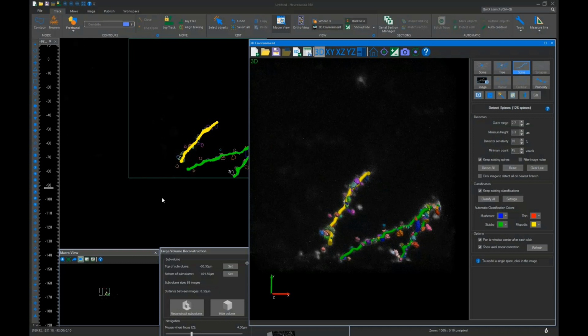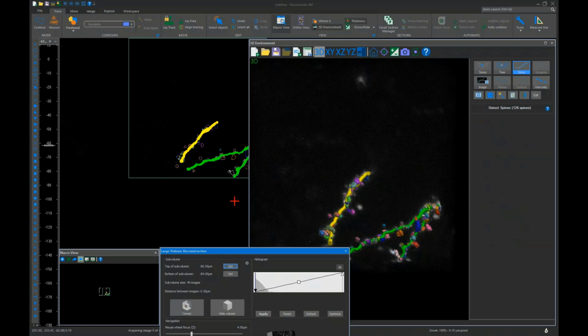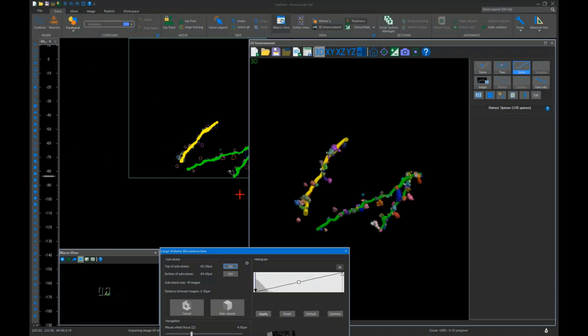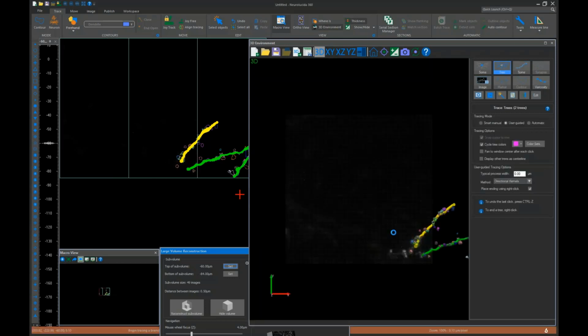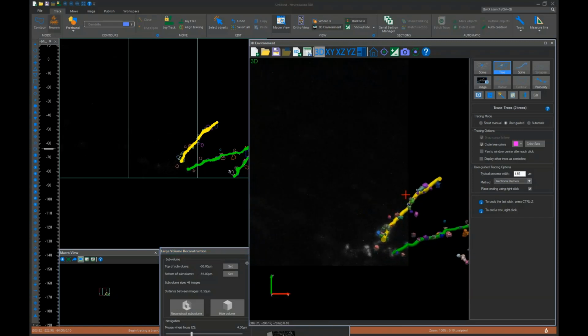When you have your reconstruction in Neurolucida 360, you can select a single button click to send the data file to Neurolucida Explorer. When you do so, Neurolucida Explorer will automatically calculate hundreds of metrics for you, including branch order, density of spines, if you had captured spines, per unit length of the dendrite, according to its branch order, according to the distance from the soma. You can do Sholl analysis. There's all sorts of things.